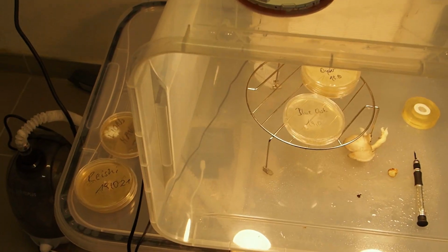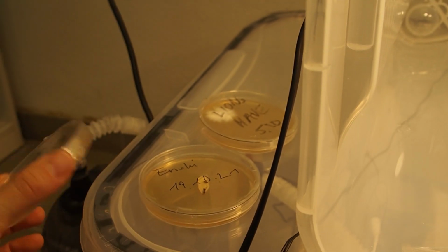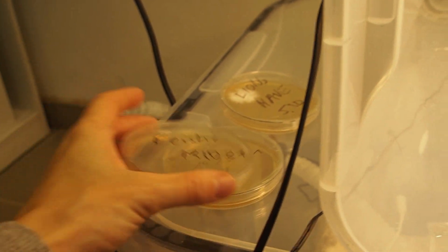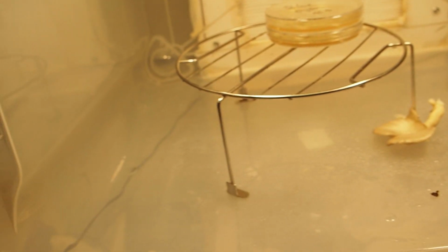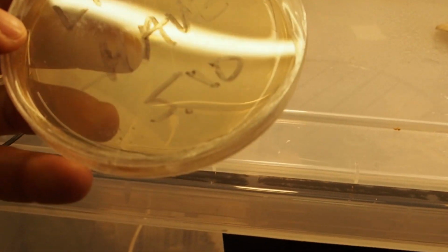Okay, that's it. Okay, so finally I'm done. So now I hopefully have cultures of enoki, reishi, blue oyster, and shiitake again. The lion's mane is looking really promising.